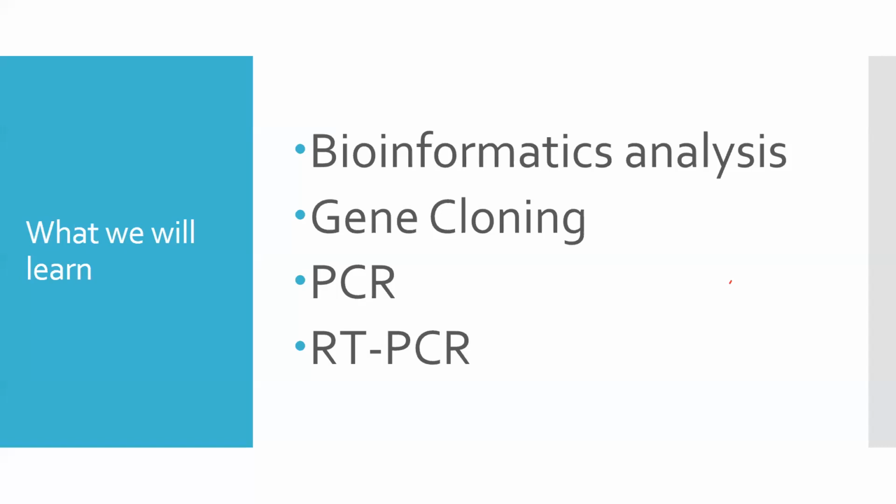So the first part will be bioinformatic analysis, then the second would be gene cloning, third would be PCR, and then a variant of PCR that we are using a lot nowadays, that is RT-PCR.